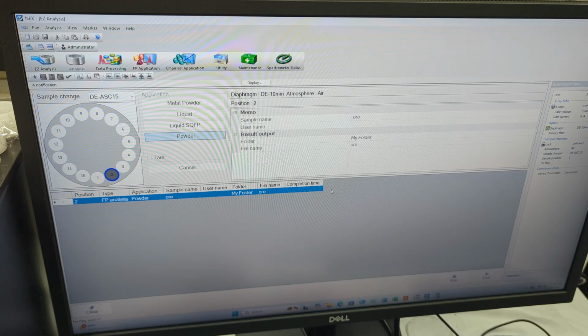And that allows us to do comparison and sets standards of what we need, and what we're changing, and how what we're doing is affecting the changes. So, again, we can measure the ore beforehand, we can measure the ore after leaching and see what difference it has. And same thing with the powder. When we electrolyze it, we can measure the powder, see what's inside of there, do chemical steps, refining steps to change that powder, and see what changes in our steps.